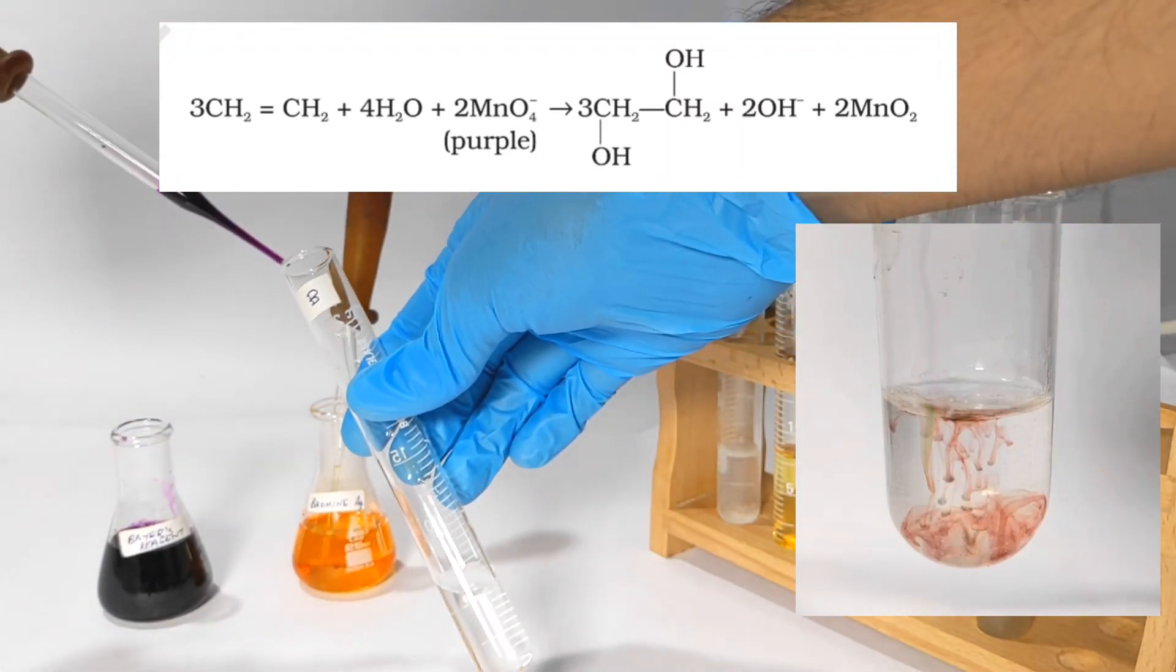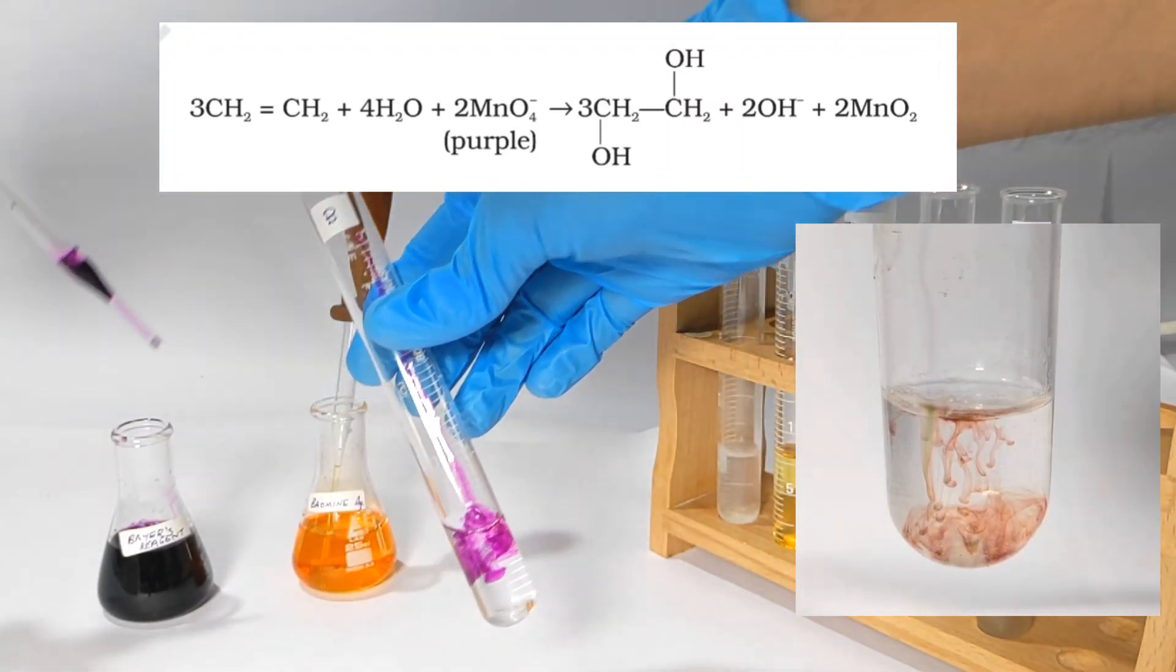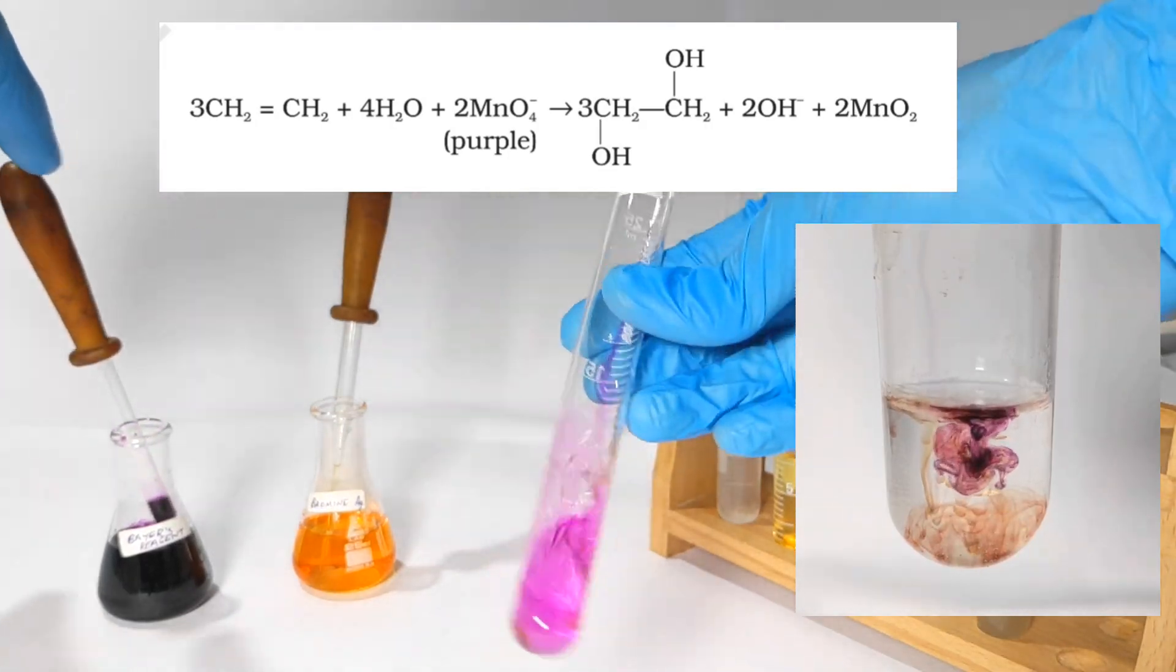You can see that the purple color of permanganate persists in test tube B which means there is no reaction in test tube B.